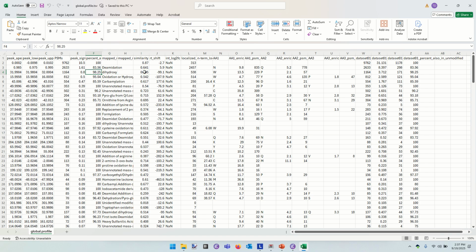All right, now we saw that 32 was really popular. Here it is again, dihydroxy. Under what conditions do we see dihydroxy showing up in a lot of popular ways? Here we see that W is very, very much overexpressed, is very enriched among those peptides that get dihydroxy. So tell me about tryptophan. What do we know about it?